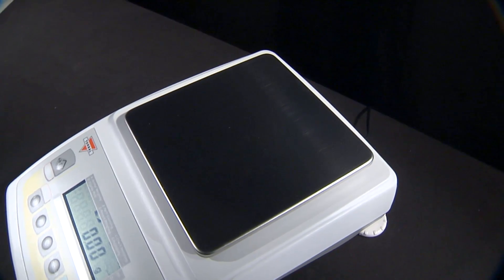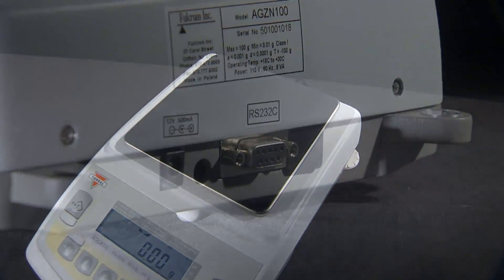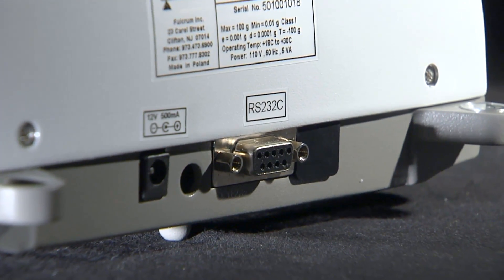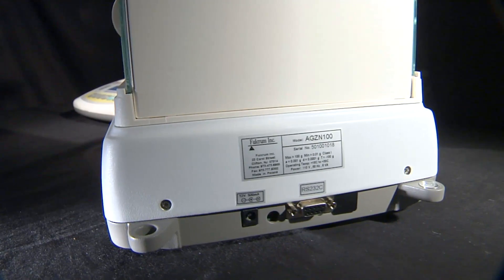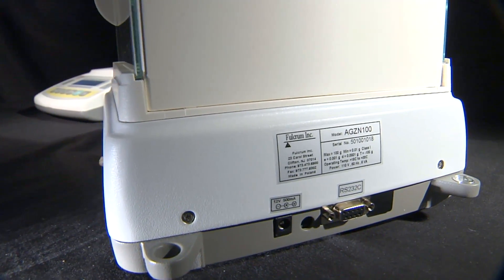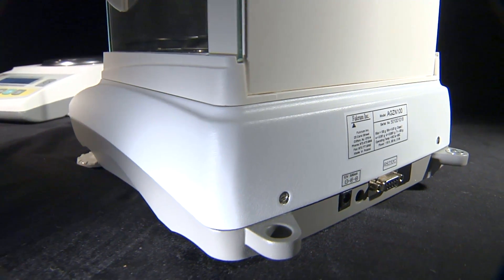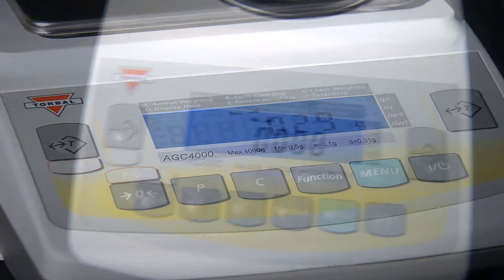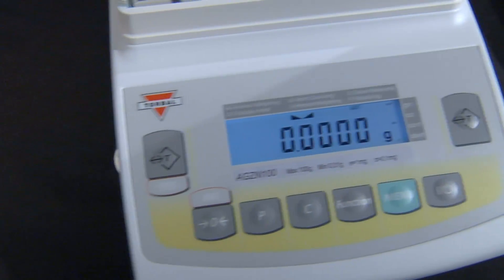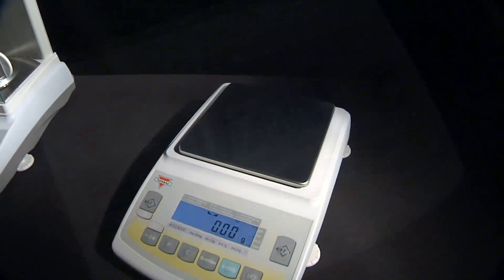High capacity precision AGC scales feature a square stainless steel pan. A programmable RS-232 communication port is standard on all scales, allowing data transfer from the scale to a printer, computer, or other peripherals. The scales are equipped with a large backlit seven-segment LCD display.